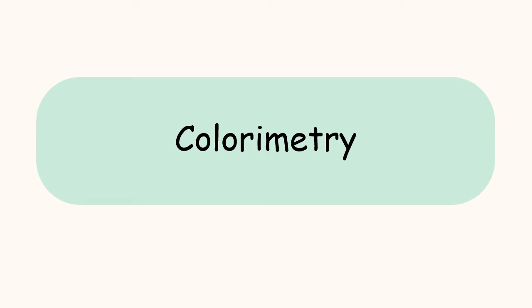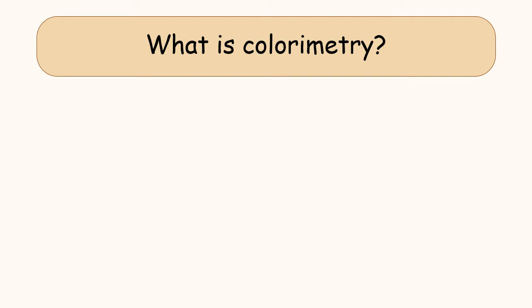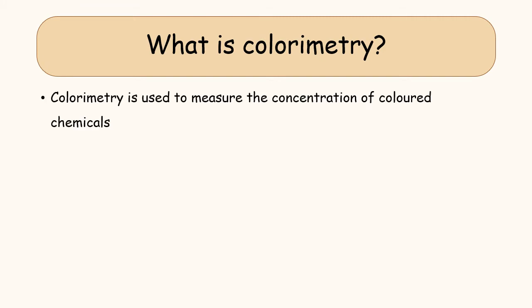Welcome back to Unit 3 of Advanced Higher Chemistry. This is going to be a short video on the technique of colorimetry. So what is colorimetry? Well, colorimetry is used to measure the concentration of coloured chemicals.